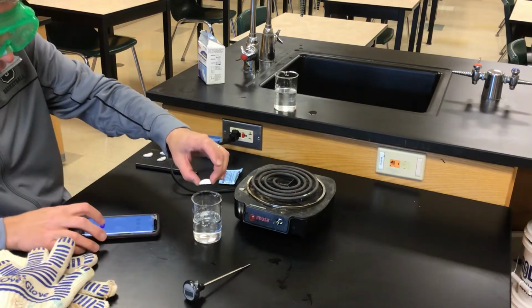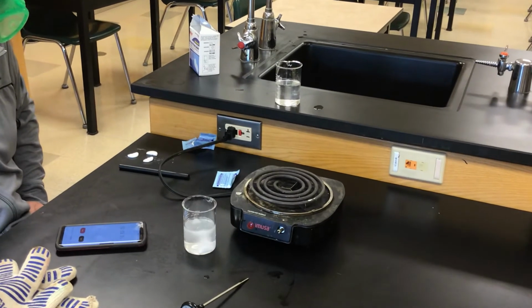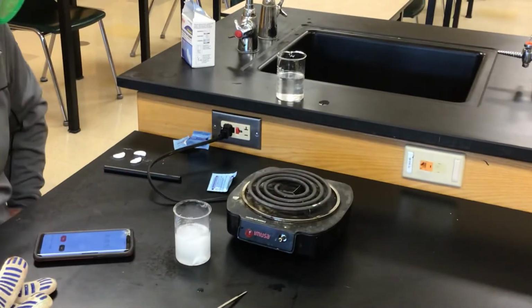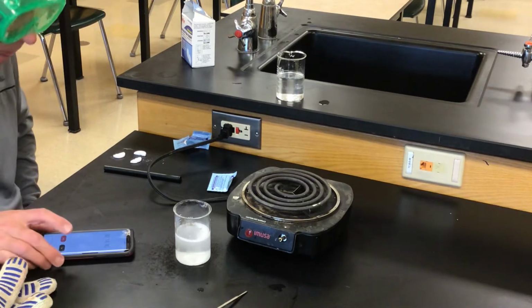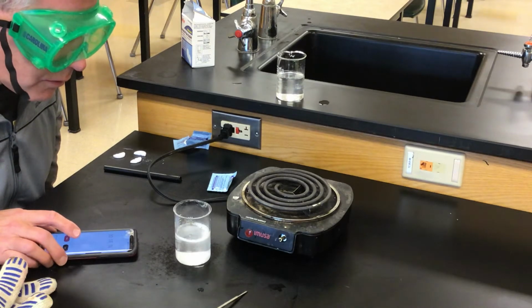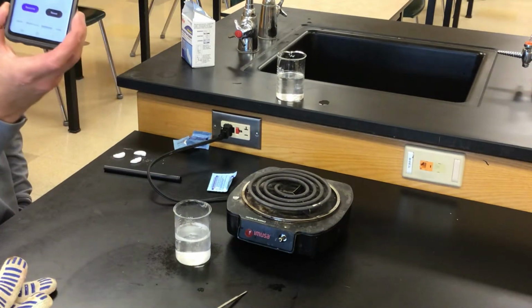We will drop this in and time it. I don't know if you can tell just by looking at it, but it seems to be going a bit faster. And we'll call that one done at 21.53.